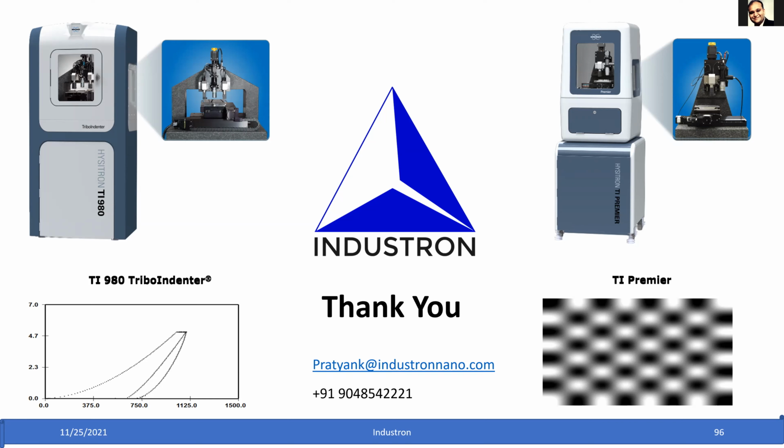Yeah, thanks. Thanks, Dr. Asif. Pretty interesting talk. So I've got a few questions lined up. First question from Sujata. She wants to know what are the basic information that we should keep in mind while performing nanomodulus mapping on porous ceramic coating. What are the other characterizations we can perform on metal ceramic composite using a nanoindentation instrument?